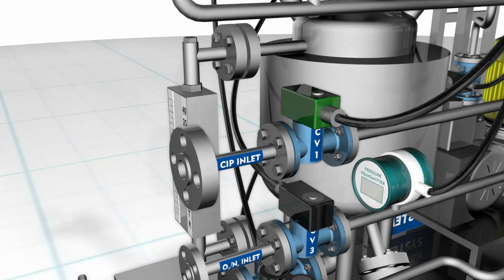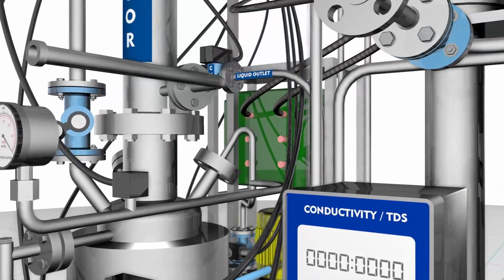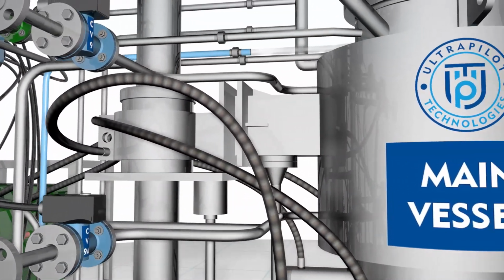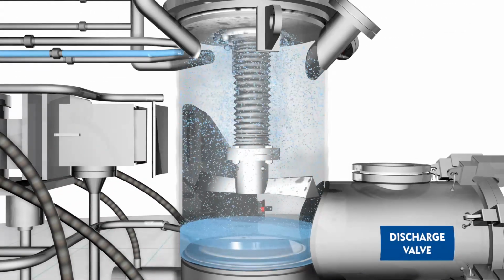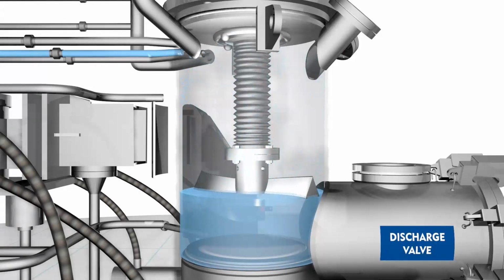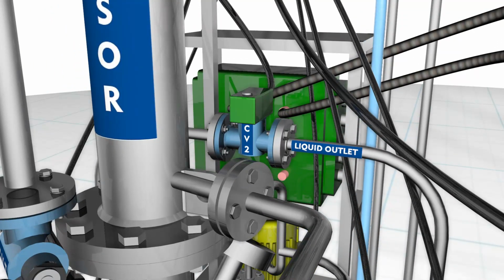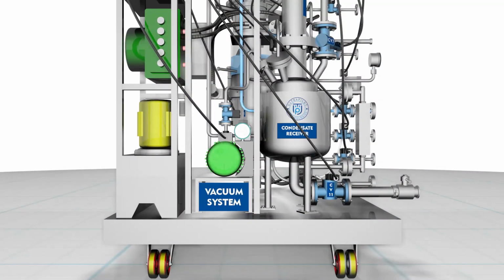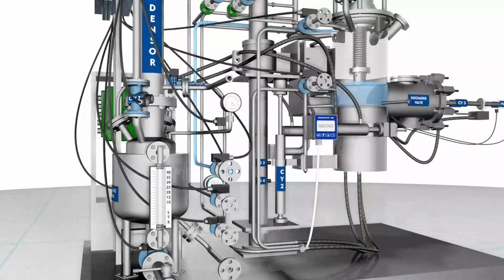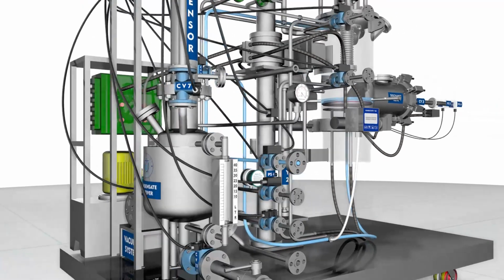The cleaning in place cycle is commenced by opening the CIP inlet control valve CV1, which will flush cleaning fluid into the system through CIP nozzles CIP 1 to 5. The time cycle can be set manually for this operation. The outlet valve CV2 has to be kept open, and the vacuum pump is started to flush the liquid out of the system. The whole cycle 1 to 5 will be repeated by keeping the discharge valve and the bottom section partially opened.